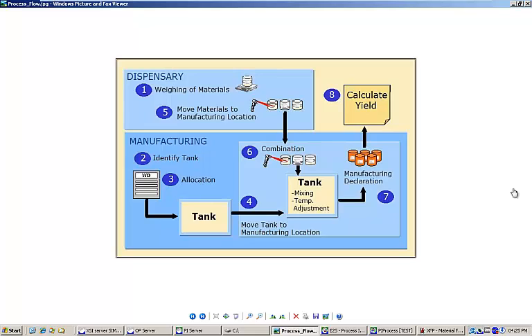During mixing, the temperature of the compound will be measured and the operator will be prompted to perform a temperature adjustment if required. Finally, the new stock will be declared and the EBR will automatically calculate the batch's yield.